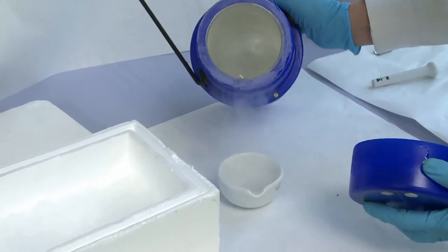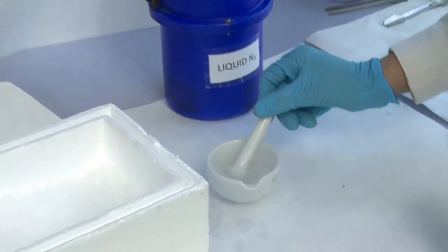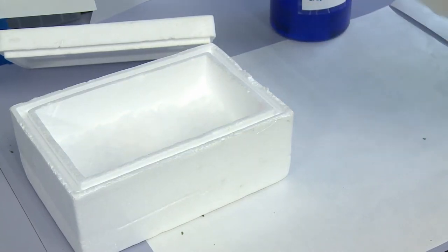Or according to the laboratory facilities, you might use a previously chilled mortar and pestle, keeping the sample frozen by adding liquid nitrogen when required.